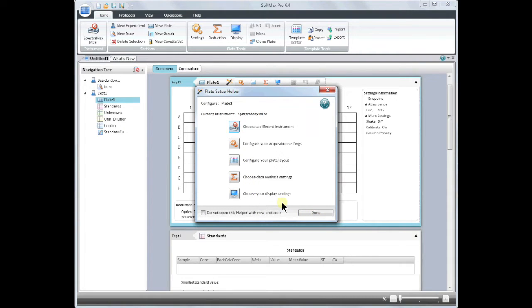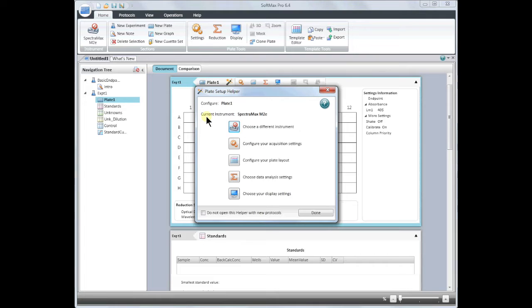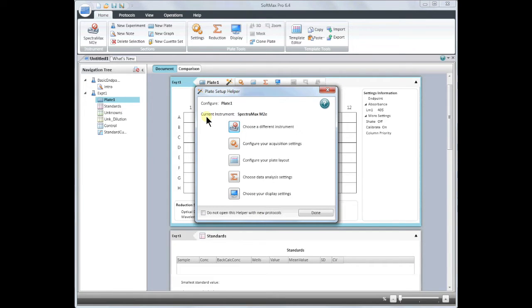We will begin by connecting your instrument. As you can see in the upper left-hand corner, the SpectraMax M2E that I wish to use is not connected. To establish a connection, first make sure all of the cables are securely plugged in to both the instrument and the computer. If you are using the serial port to USB keyspan adapter, make sure that you are using a USB 2.0 port, not a 3.0 port.